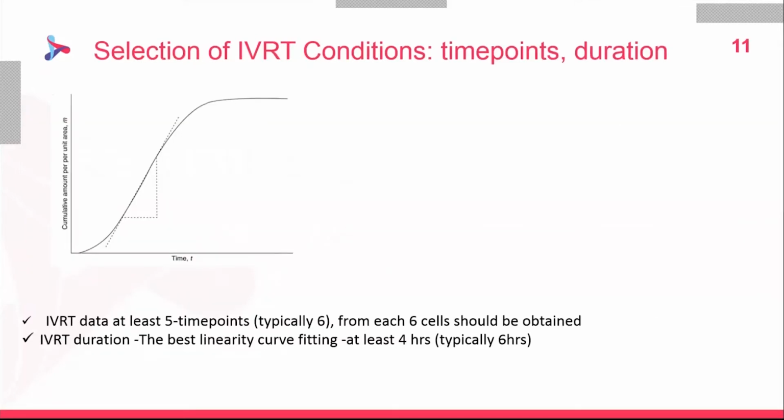Therefore, the IVRT duration and length of experiment in many cases is the subject of discussion. EMA has already introduced in the latest guidance that IVRT duration should be sufficient to characterize the release profile, more than 70% of API release. Apparently, this is more appropriate for, for example, ophthalmics, nasal inhalables, buccal and sublingual site absorption. Most topical dermatology products do not reach 70% release in 6-8 hours of IVRT duration. So to achieve this value, prolonged experiments are needed that do not mimic in vivo conditions.